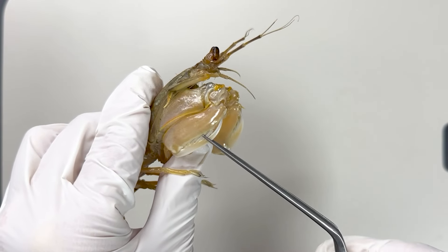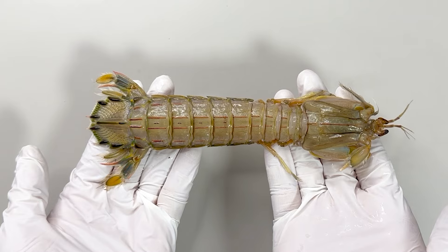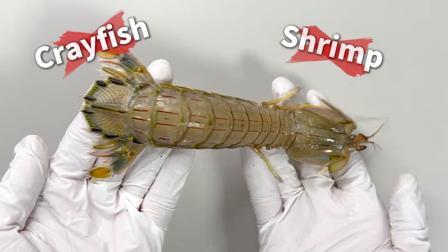This creature is a mantis shrimp, also known as a sea mantis. Contrary to its name, the mantis shrimp isn't related to crayfish or shrimp, but is an intriguing creature in its own right.